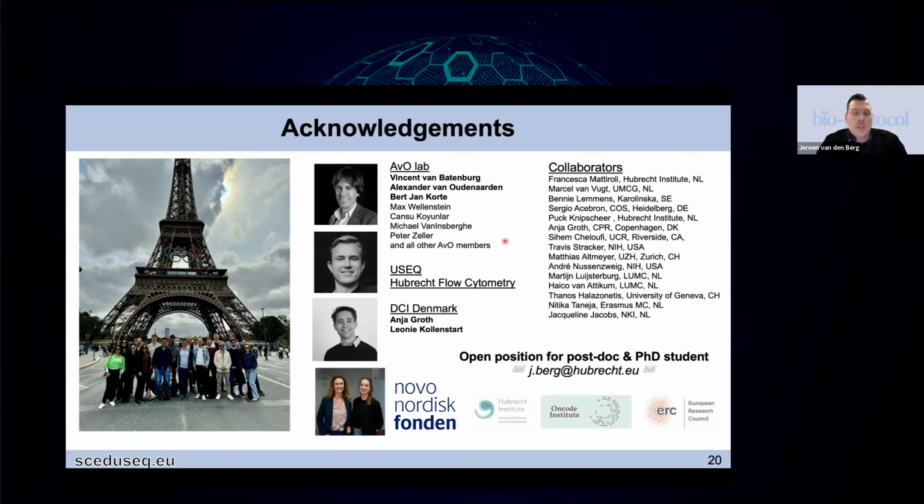The issue there is that the repetitive nature also makes it quite difficult to make these estimations, and we haven't mapped these data to a telomere-to-telomere genome that would be necessary to make these analyses. But in principle, if regions of the genome were unique enough, we would be able to extract DNA replication speeds from them.